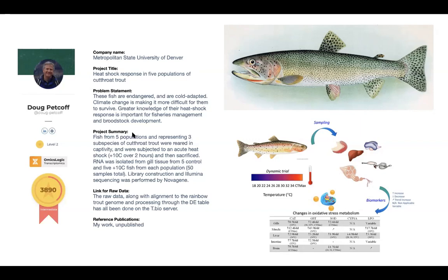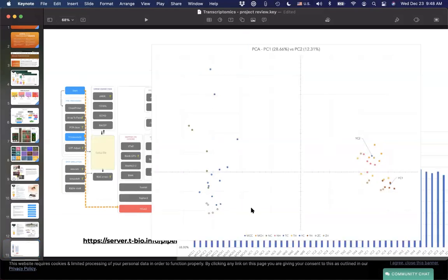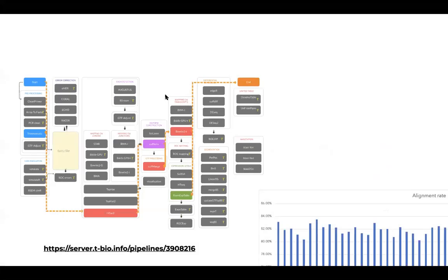Exactly. Yeah. So let's talk a little bit about this analysis. So here we have, I'm just going to move this for a second. So here we have your pipeline, right? And so the first thing that we should mention here is one of the challenges is actually having a non-model reference organism, which has many differences than you would standardly work with a mouse or a human genome, because you have to map on this genome.